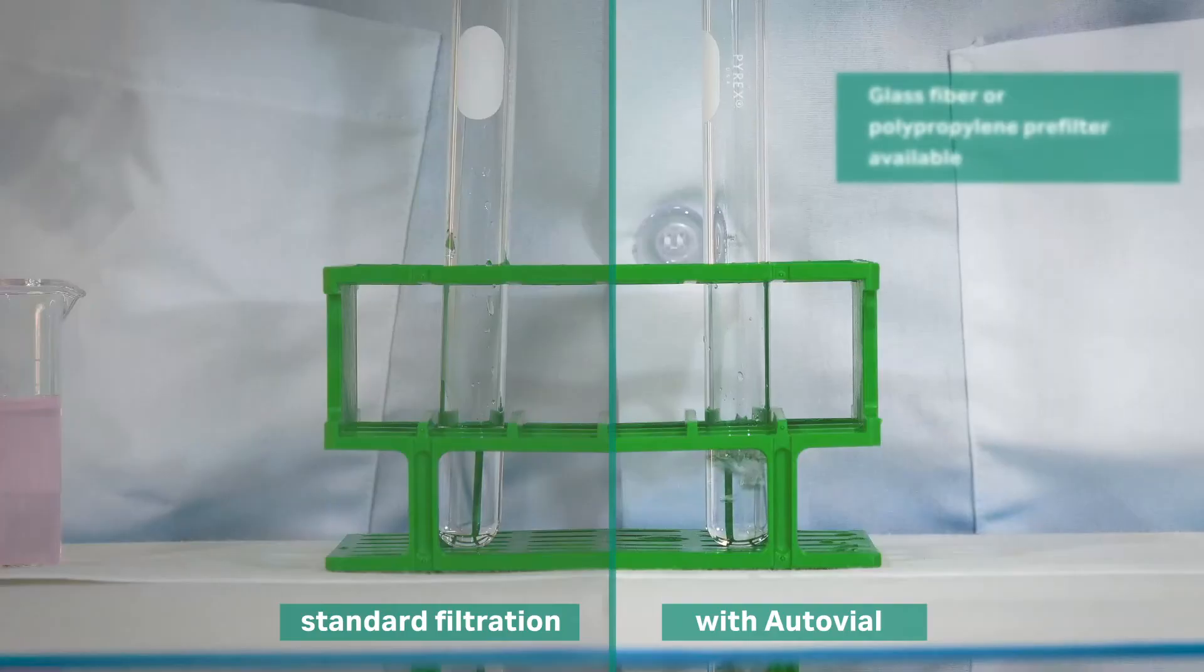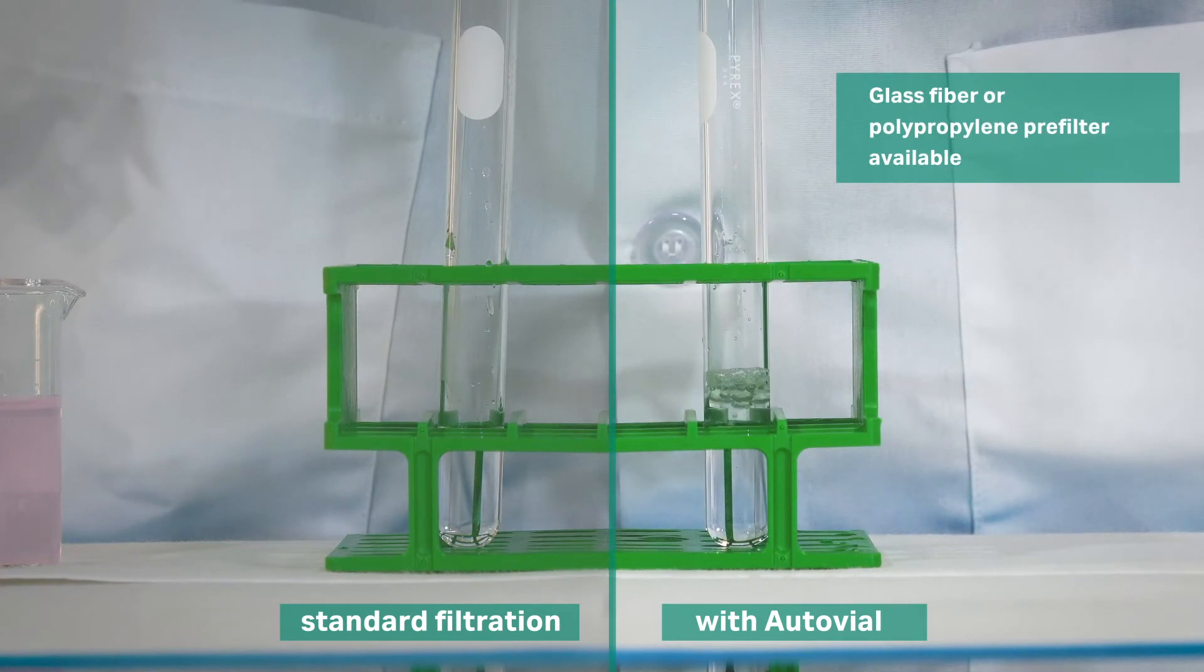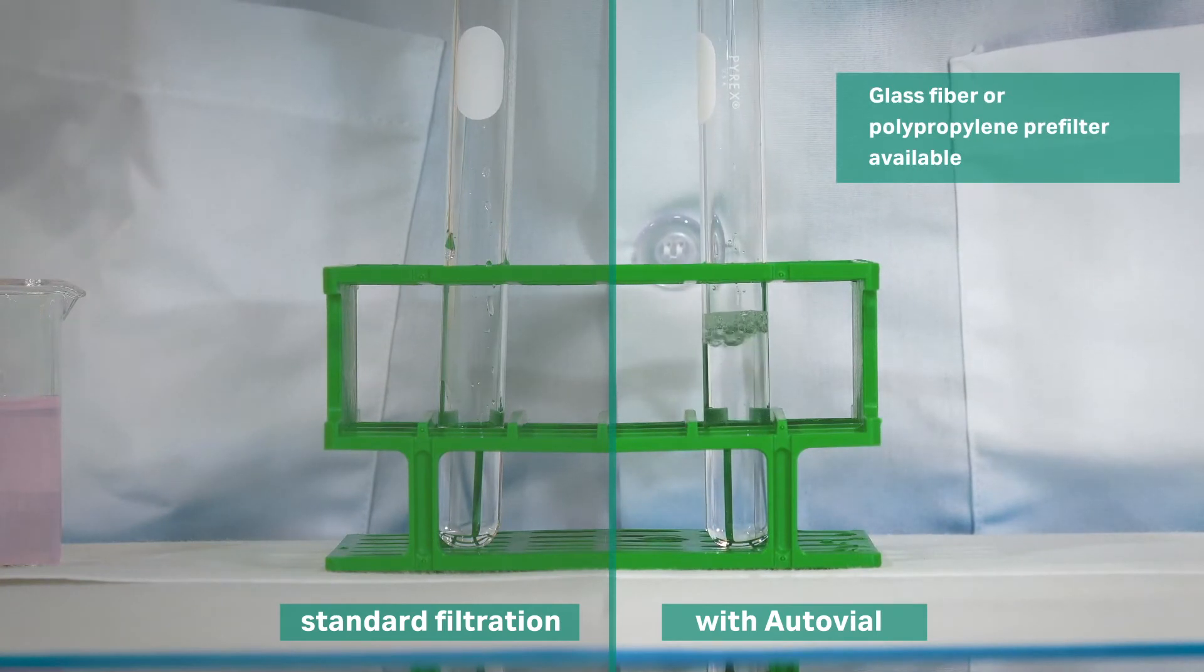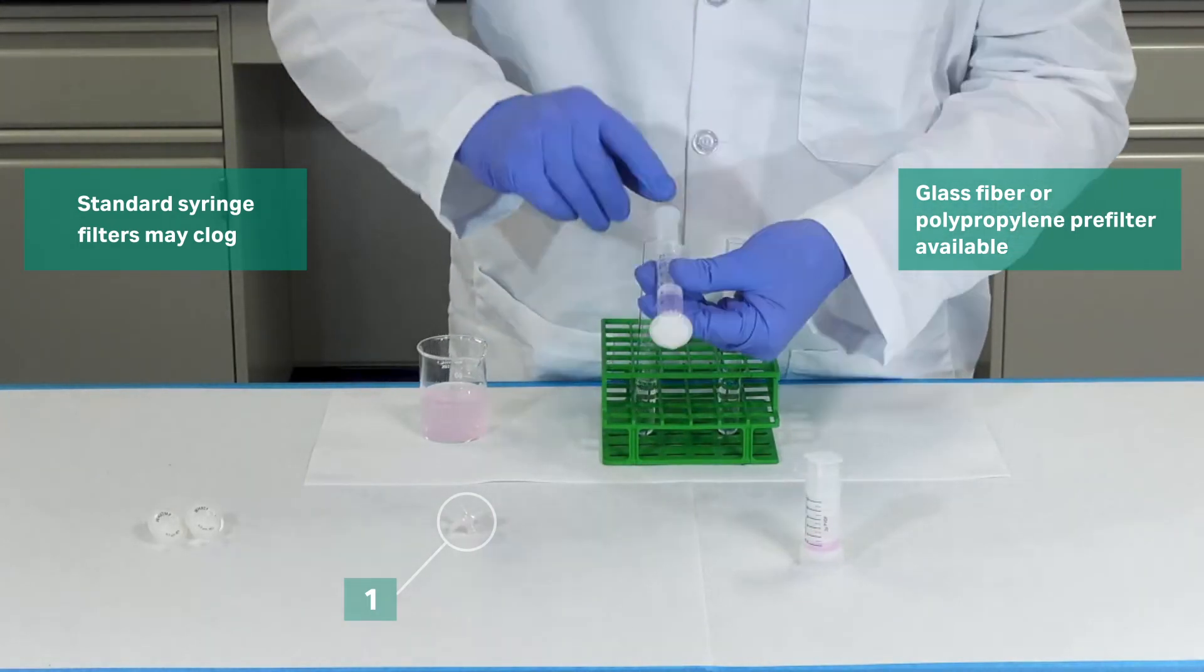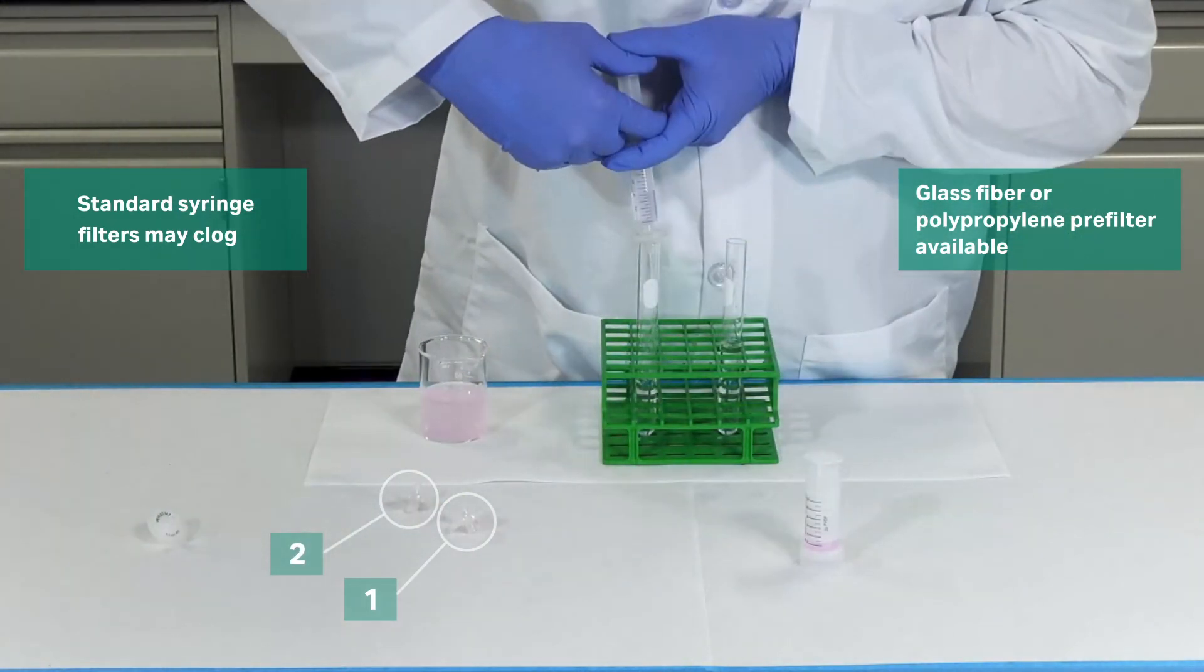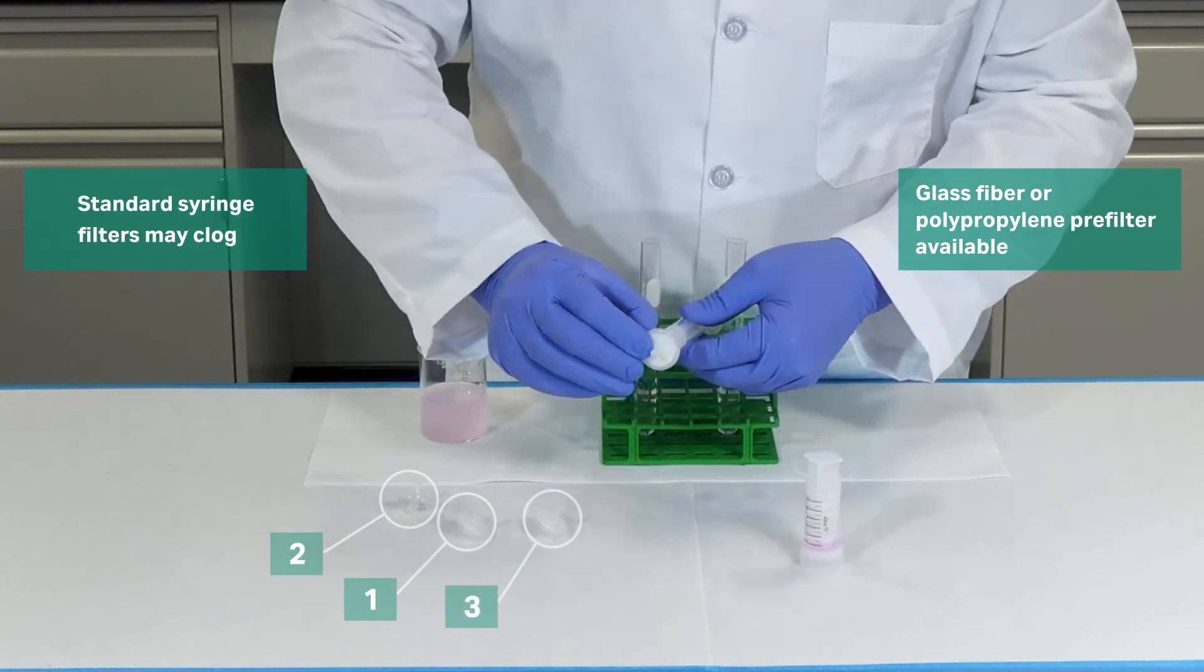This can be achieved using the built-in glass fiber or polypropylene pre-filter available in selected models. The sample shown here would have required at least four syringe filters using the conventional method due to clogging.